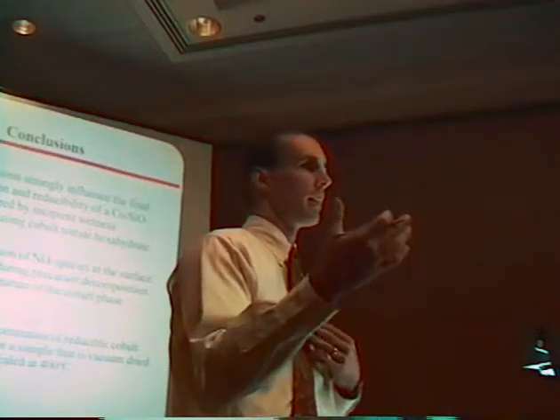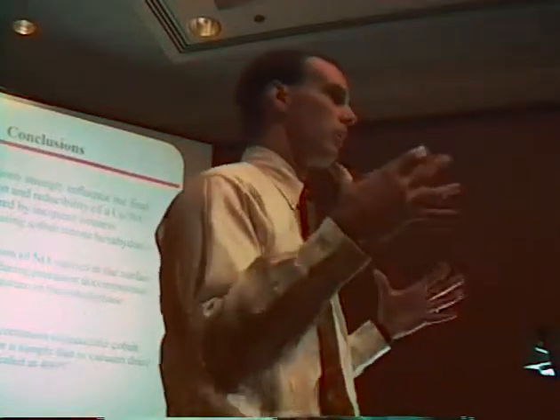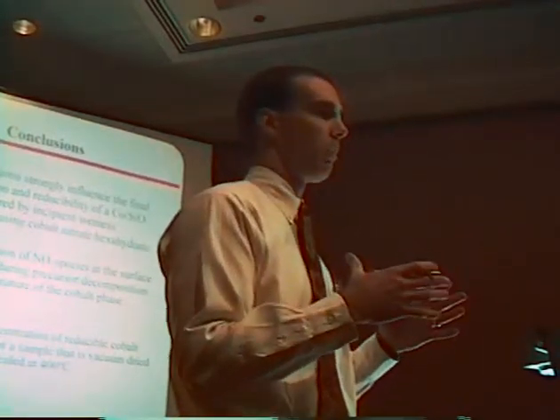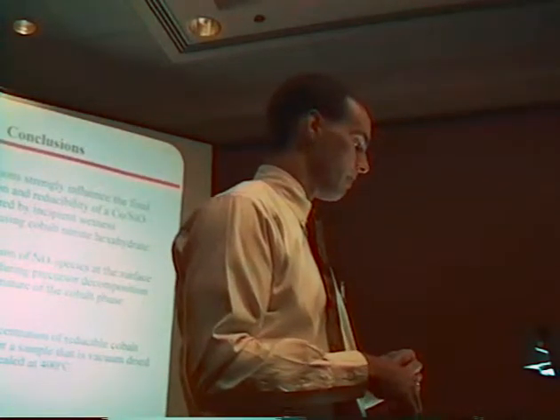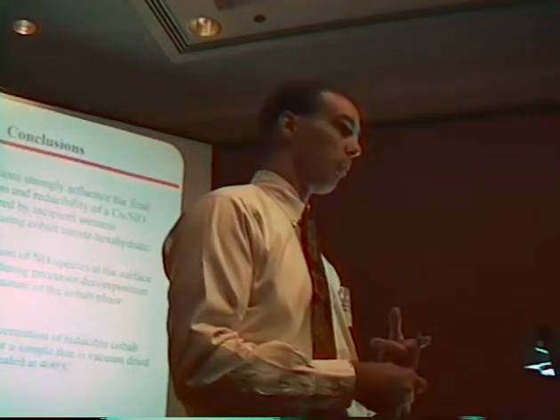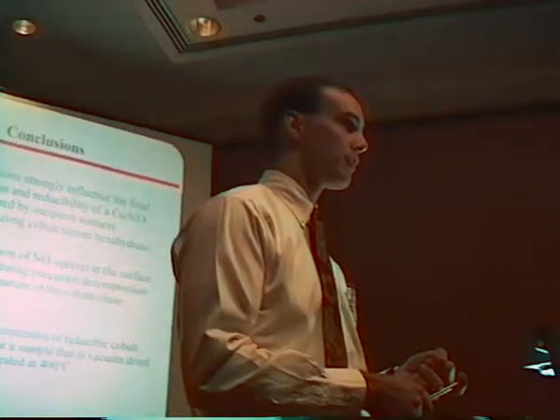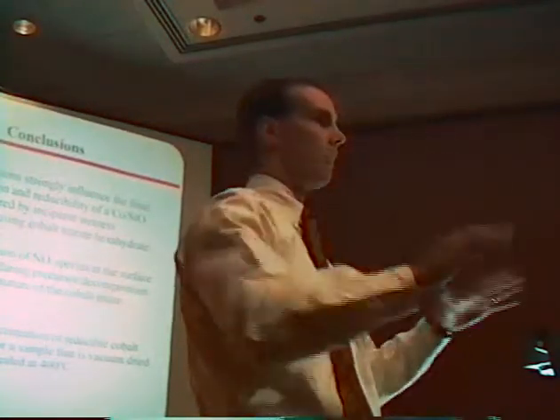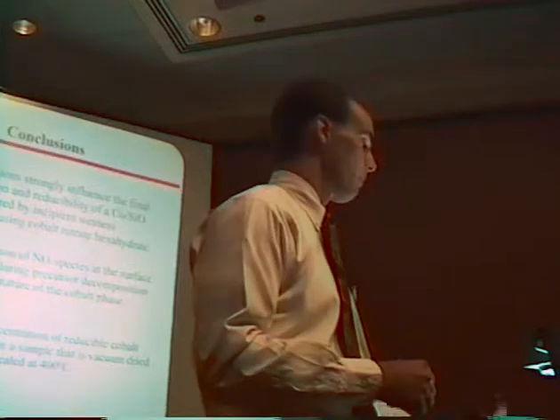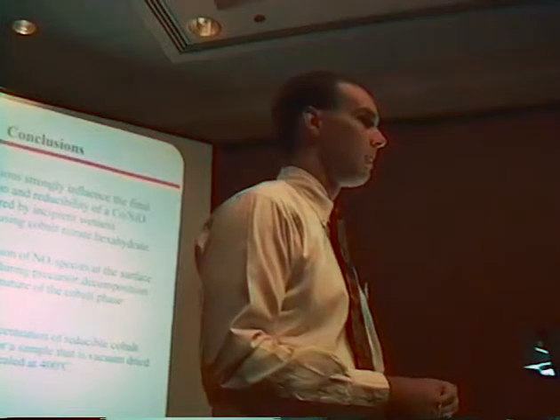They state that in large concentrations of NO2, which oxidizes extremely well, you will get the formation of large particles of cobalt. Some of the things that we are going to pursue are the use of a cobalt chloride precursor or a cobalt carbonate precursor, to see what effect the removal of those types of species has on the overall final state of your cobalt. But we feel that the NOx, specifically the NO2, oxidizes the cobalt.